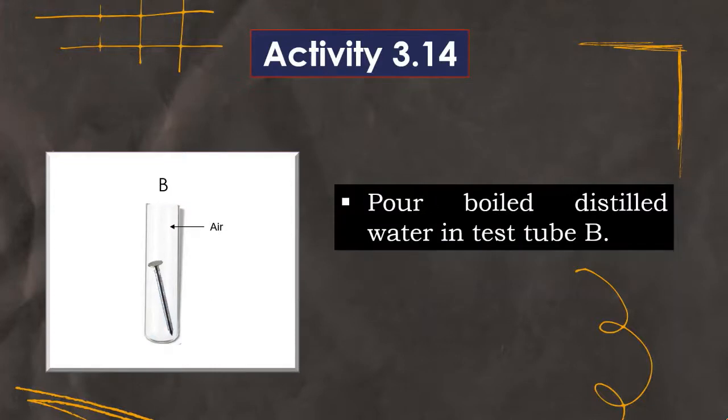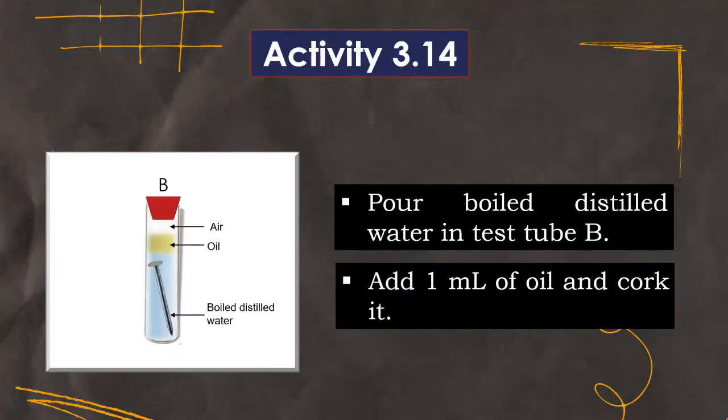Next step is pour boiled distilled water in test tube B, then add 1 ml of oil and cork it.